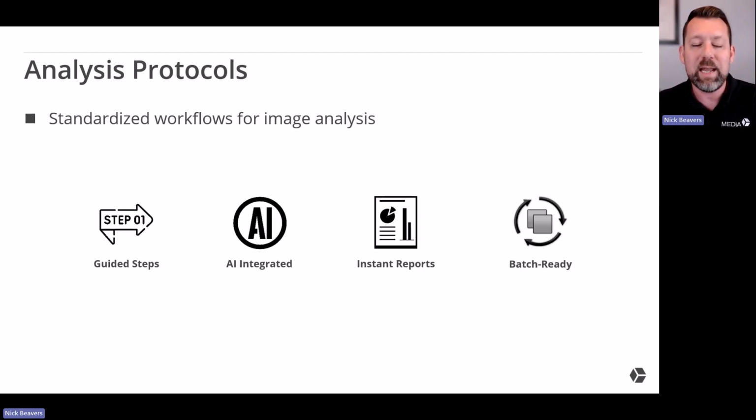template reports, and of course, being able to remove that human step where you're having to make a judgment call as to whether a particle or a fiber should be counted or not. When you batch process, you're establishing your rules up front, and you're eliminating the human bias by having to do it in an automated way. And at least it's consistent from one image to the next. So these types of things will help your standardized workflow, help you be a little more efficient.